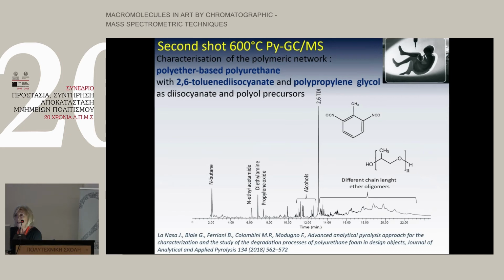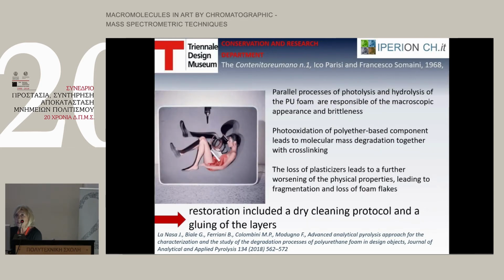So the main information is in the first part, when you see that you have no more plasticizer.